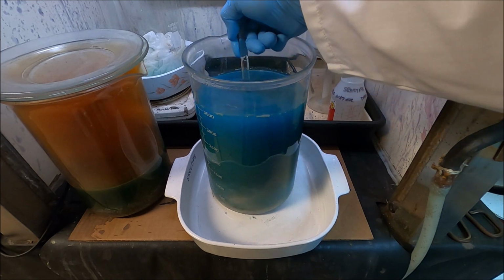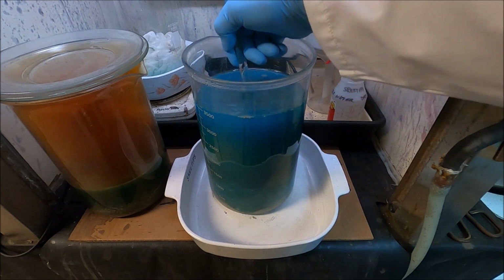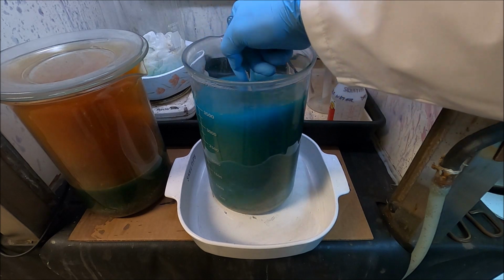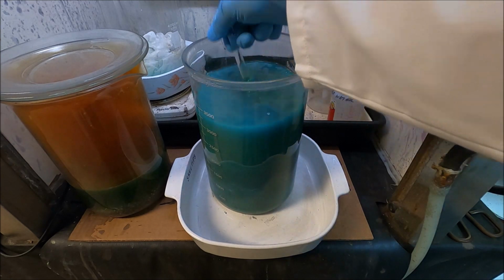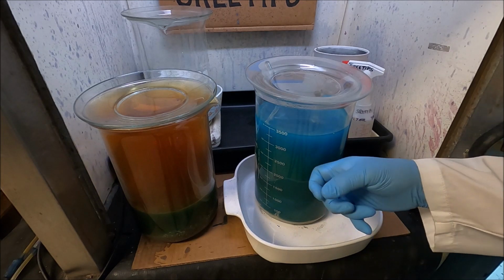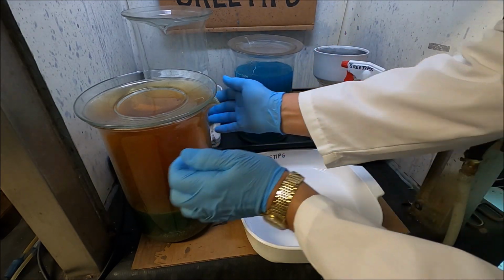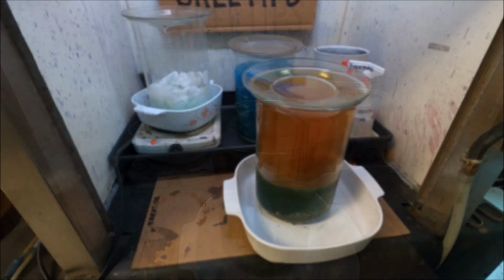Just gotta get a piece of copper up here if we can look at it. I guess I can't. I think it's pretty much all the copper has traded places with the silver now. So all we have down in the bottom of that beaker is silver. Silver powder. Once this solution settles down, I'll draw off that copper solution out of there, get it ready to go into the waste treatment bucket. And so we'll just let this reaction continue here.